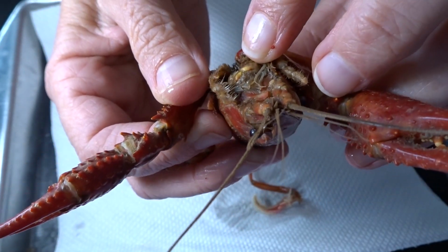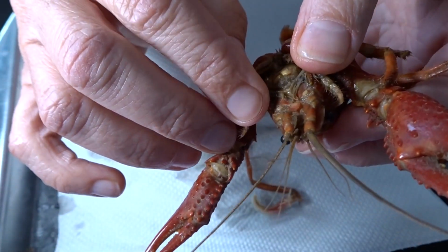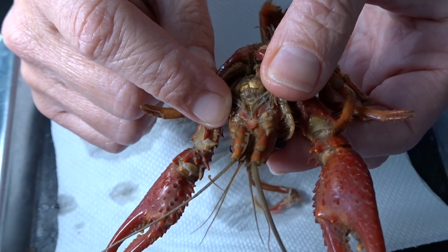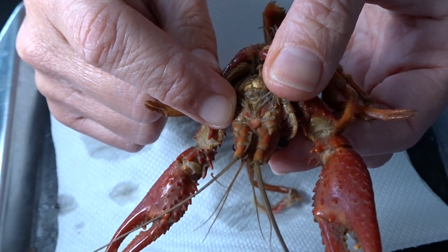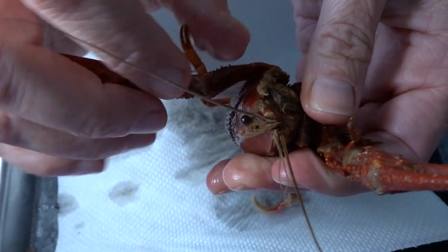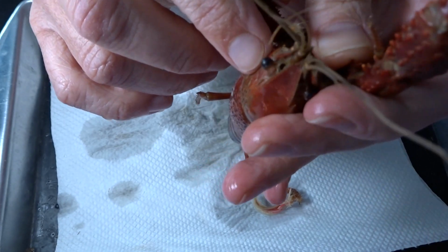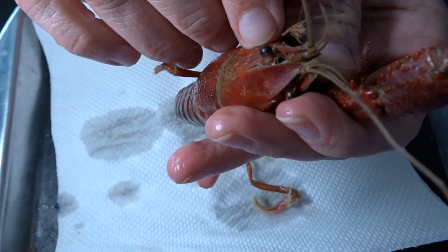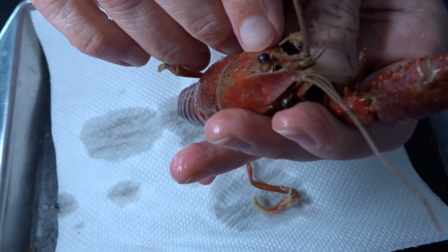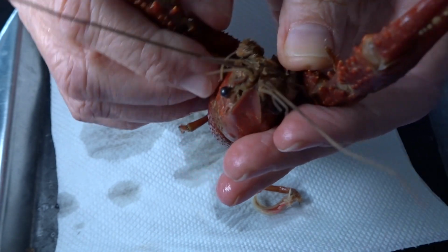It's pretty crazy. And right here, I should use my pointer. Right here, those little openings, do you see that? Those are the excretory glands for the nitrogenous waste. So if we looked on the inside, right here at the base of the eye, when they showed you in the dissection, that's where that green gland would be. The nitrogenous waste, analogous to the kidney in us, analogous to the nephrostome inside the earthworm.